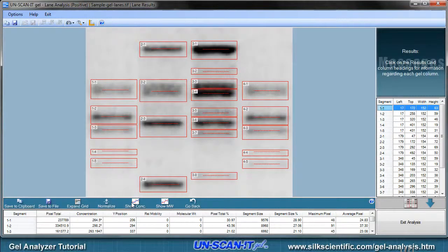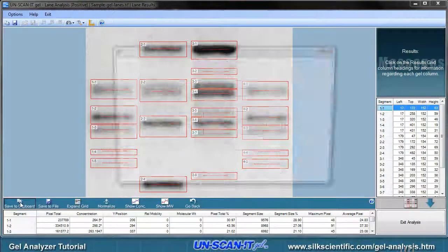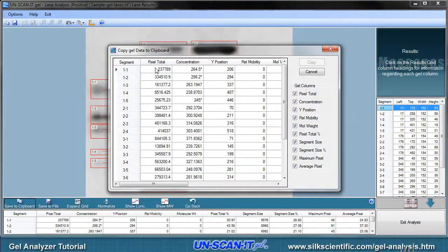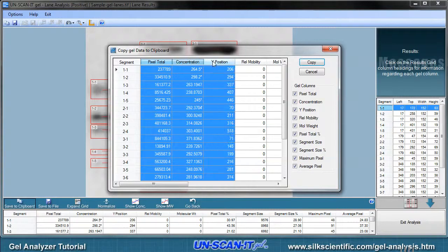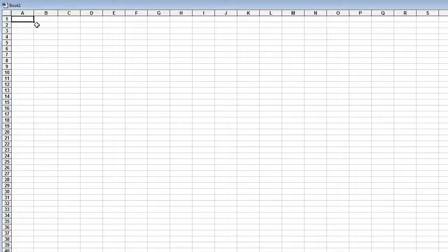The data can then be saved to a data file or copied to the clipboard, and pasted into Excel or any other spreadsheet or data analysis program.